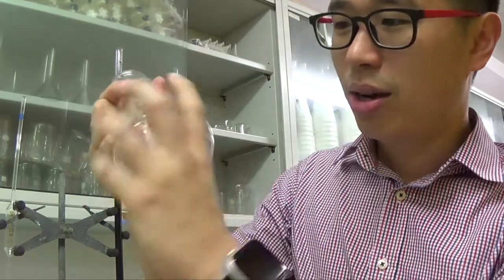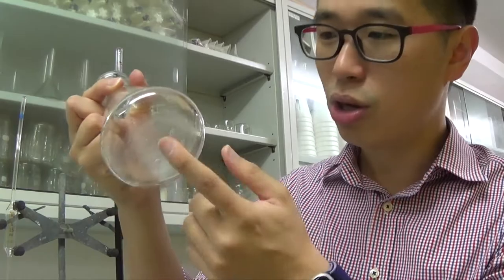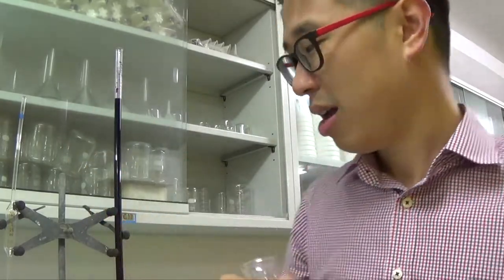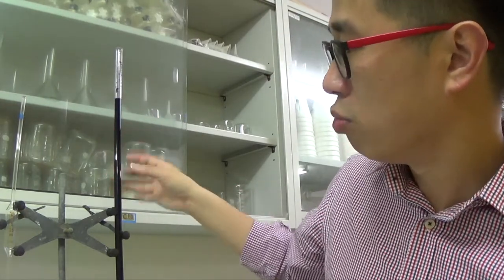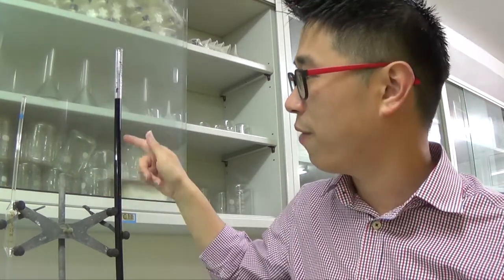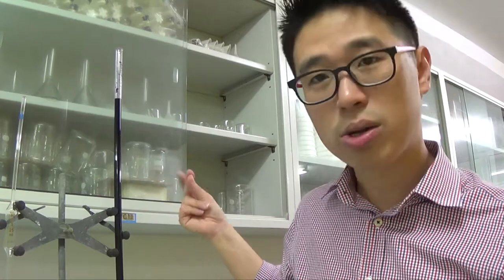So that's why the conical flask, the thing that you prepared out, that conical flask, you must not wash it with the solution because you will increase the mole of that substance that you prepared out, right? The thing with burette is, after you wash with distilled water, you must wash it with the solution that you fill in because if you have got a bit of water in there, it will affect the concentration of your burette solution. Therefore, it will affect your endpoint. Okay, so I hope that makes sense.